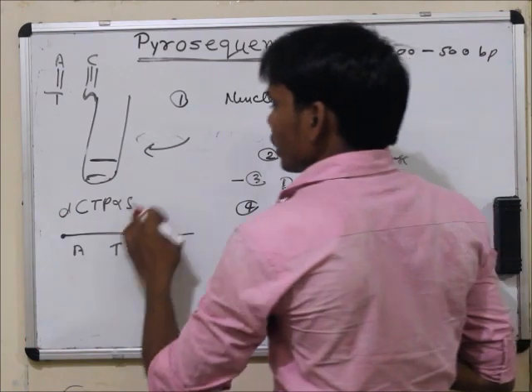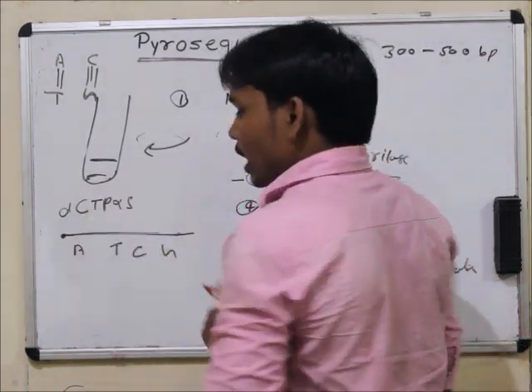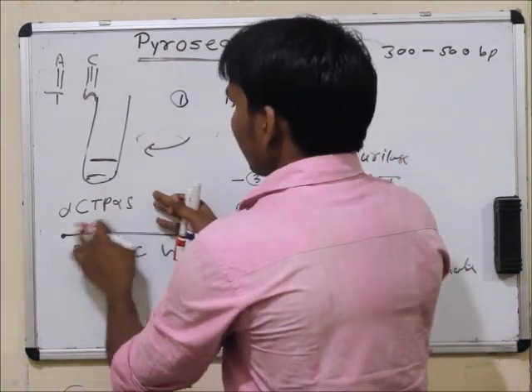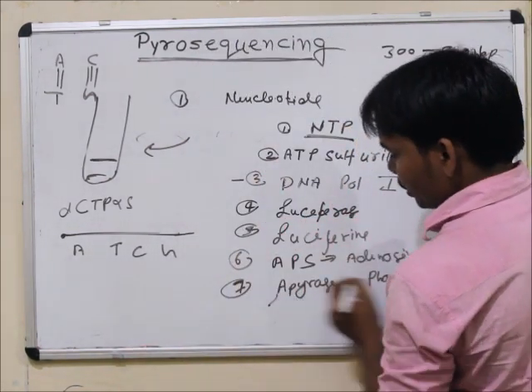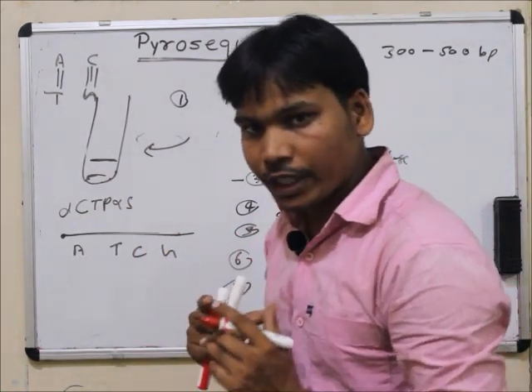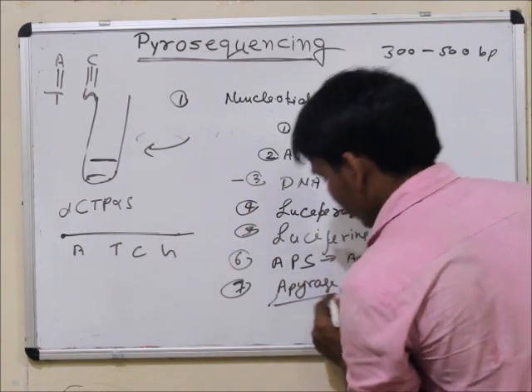So in these conditions, these nucleotides cannot be added, and in the reactions, the solutions, they can harm if they are present. So that is apyrase. Apyrase degrades unincorporated nucleotides.